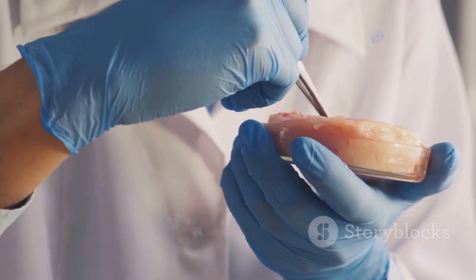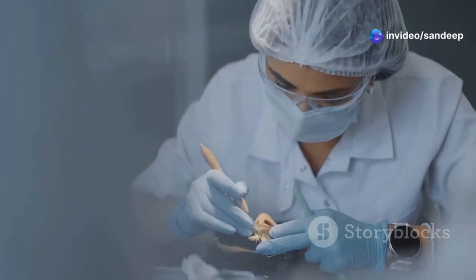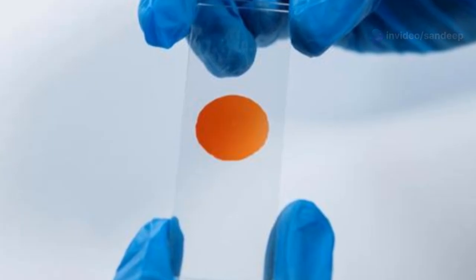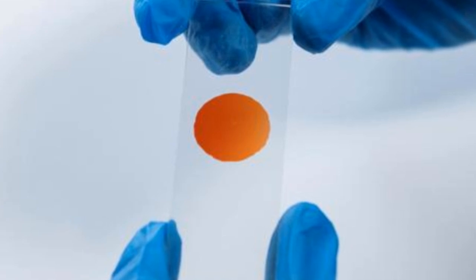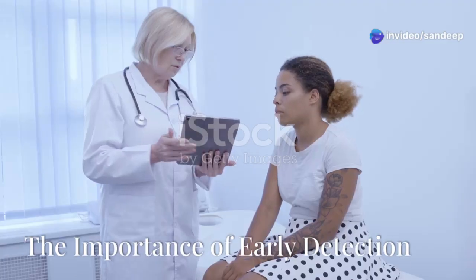The fixed tissue is then dehydrated, removing all water content, and embedded in a hard, wax-like substance, creating a solid block that can be sliced into extremely thin sections using a specialized instrument called a microtome. These thin sections are then mounted on glass slides and stained with dyes that highlight specific cellular components, making them easier to visualize under a microscope.